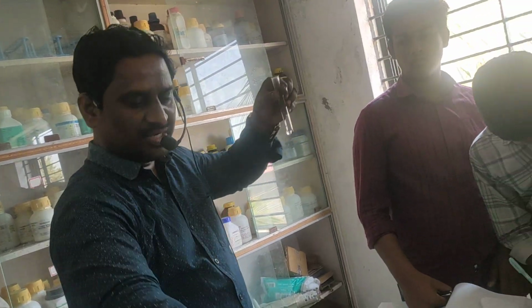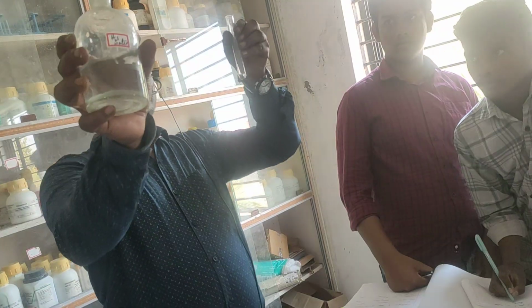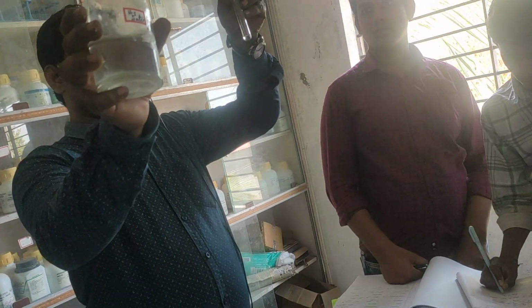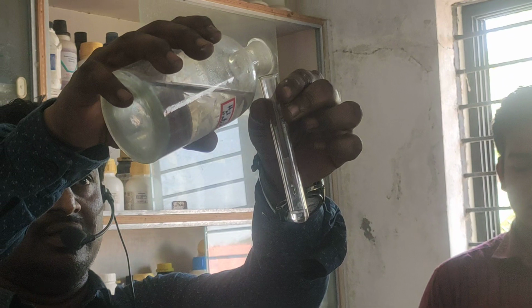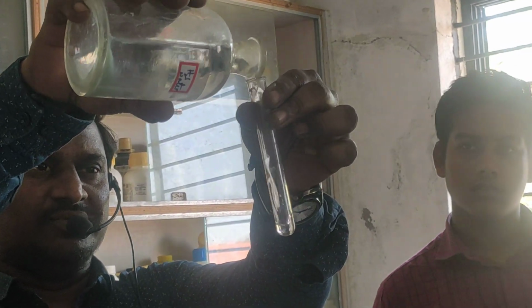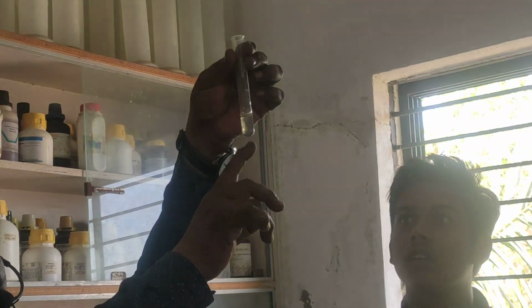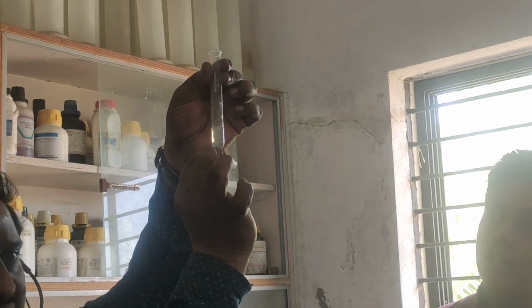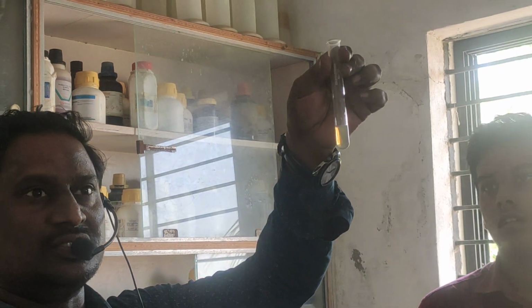For this, what do you add? H2S water. H2S means hydrogen sulfide. So you also add hydrogen sulfide. I have already added it before, that's why I am directly adding hydrogen sulfide. If you observe here, did any precipitate come up? Nothing, no precipitate is there. A precipitate should get settled down, don't say the upper layer. That is called precipitate. So no precipitate is there. Group 2 also is absent.